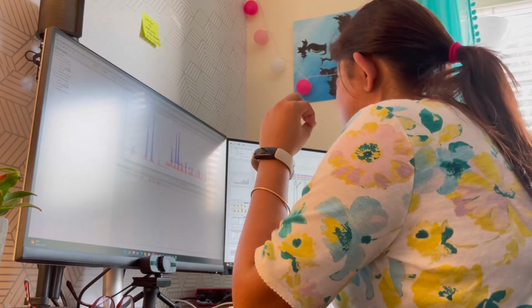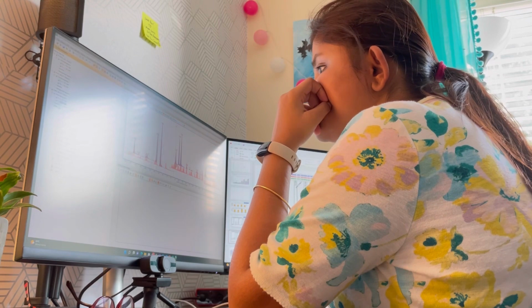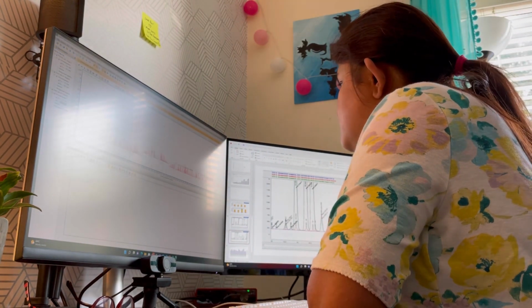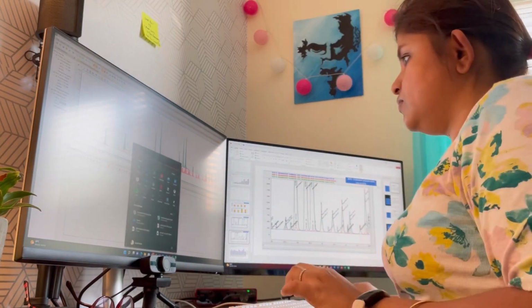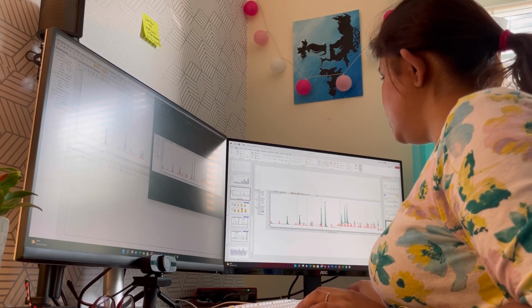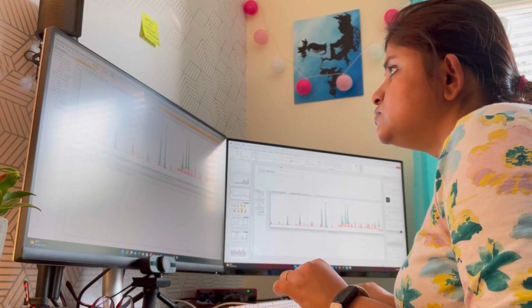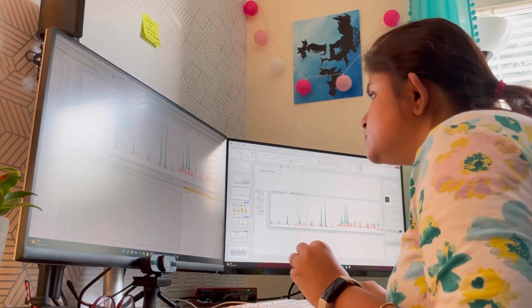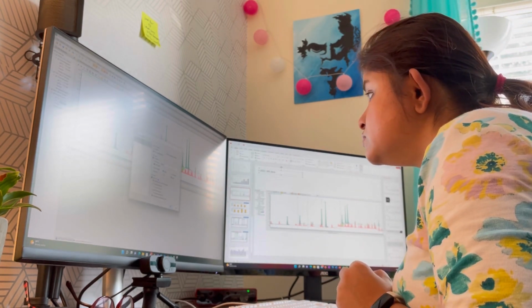Here you are seeing how I am overlaying the signals from my sample and the standard that I had run, for both the samples that I ran this time and the samples that I ran last year. Usually I integrate and assimilate all my results in a PowerPoint presentation before I send it to my advisor. So I was just trying to look at all the data and see if everything looked consistent, and everything did look consistent, thankfully. I think what happened was, since we mixed several sediments from different PCB contaminated sites, this particular batch of sediment where I was performing my experiments had a relatively higher concentration than what is found in the environment, the environmental levels per se.